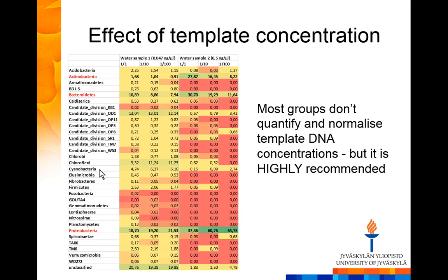So what was left of bacterial sequences was obviously way too little to make it economically sensible, but also it might have been biased. So we ended up first using primers that discriminate against the mitochondria, and then continued with the normal protocol. But yeah, everything affects.